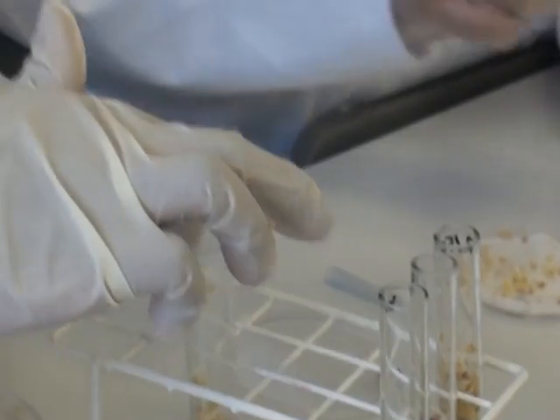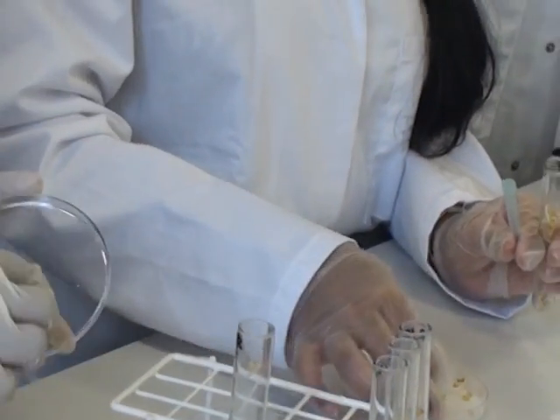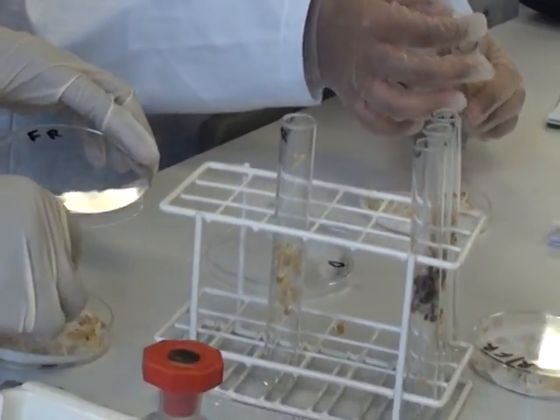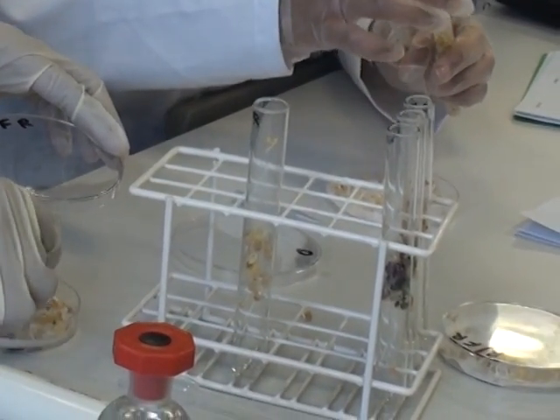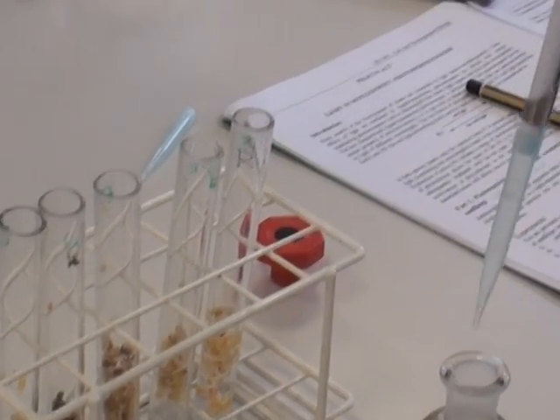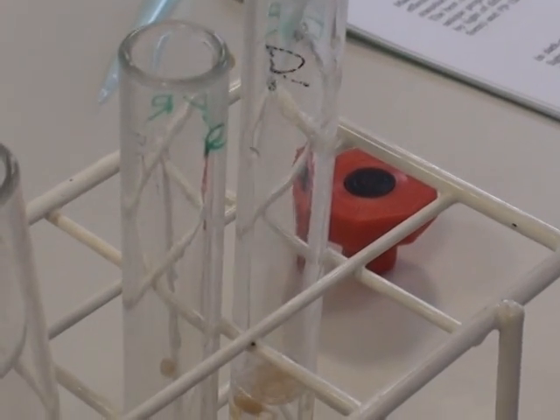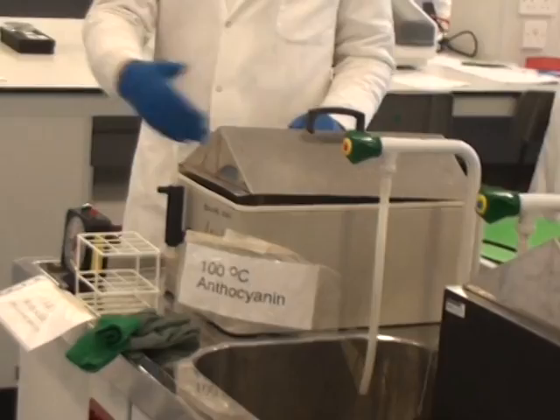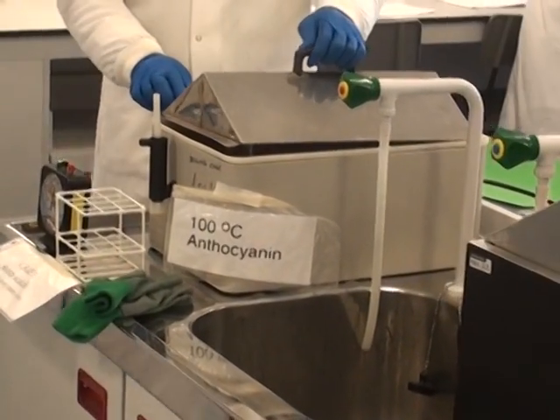To examine the anthocyanin production, we first count out 20 seedlings of each of the different treatments and put them into a test tube. Then add isopropanol water mixture which is going to extract the soluble anthocyanin pigments.